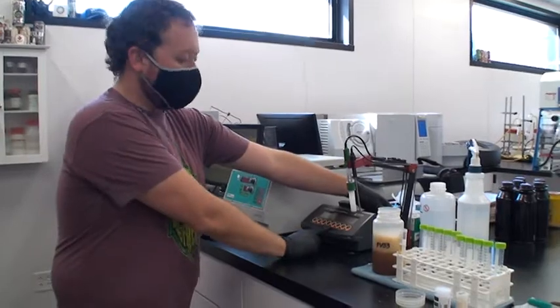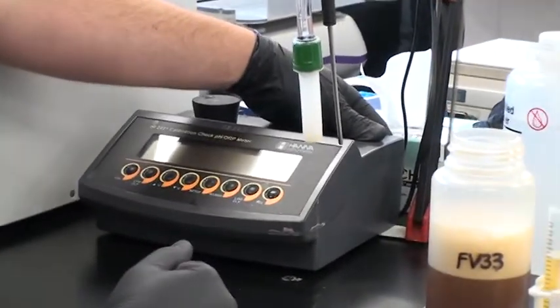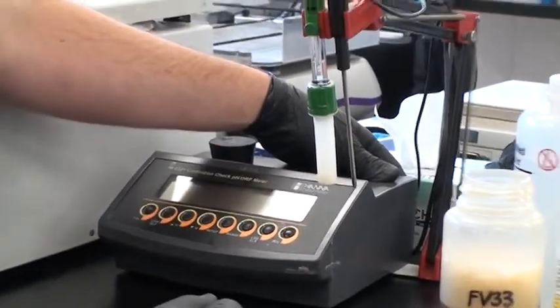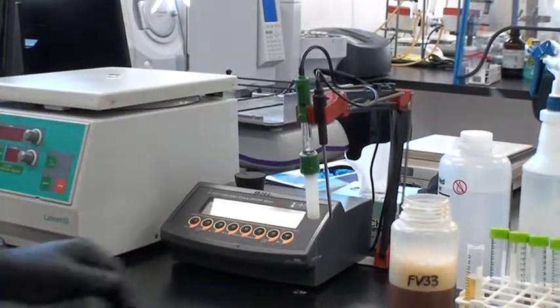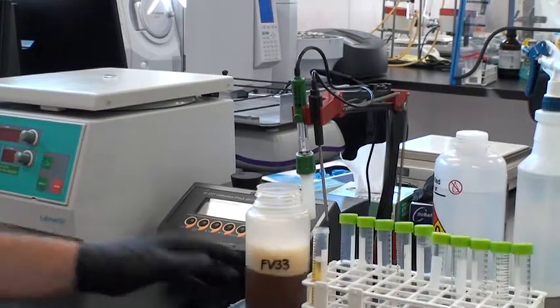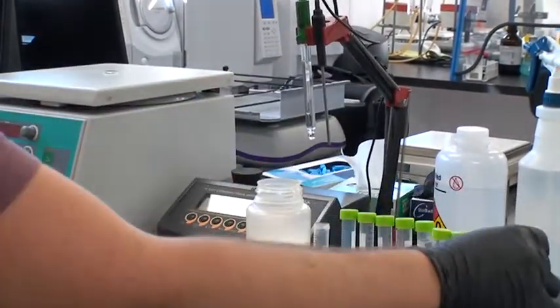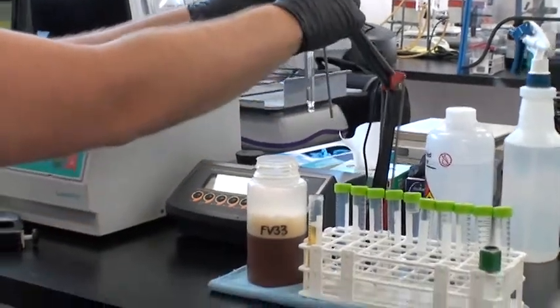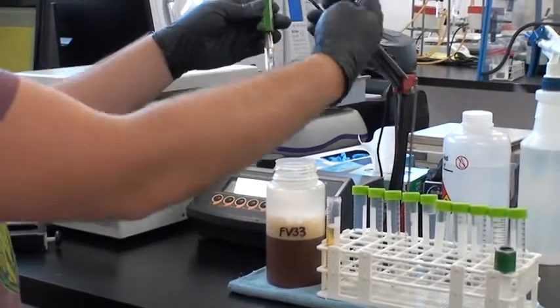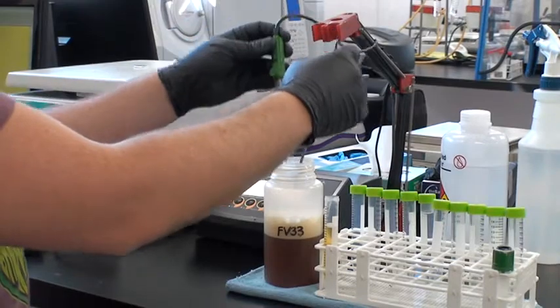This pH meter is a very nice one. New these are about $800, used around $350. We've had this one for 11 years — they last a long time, so I encourage the investment if you're serious about a good lab. You remove the cap, which is just a storage solution to keep the electrode primed. There's the electrode and the temperature probe, because pH and temperature are related and you get different readings. The temperature probe accounts for that, so you want both at the same time.